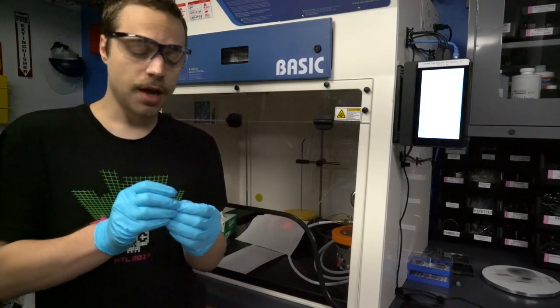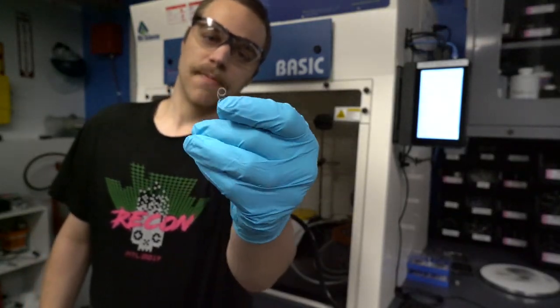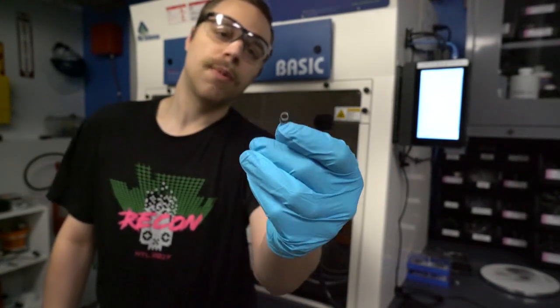The second sample we've got is a TQFP microcontroller. You can see I've already put it in a little plastic spring to hold it upright on edge, and I've cut off the pins so it fits in the mold.